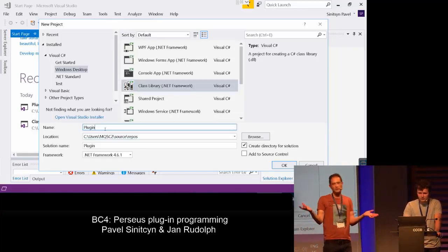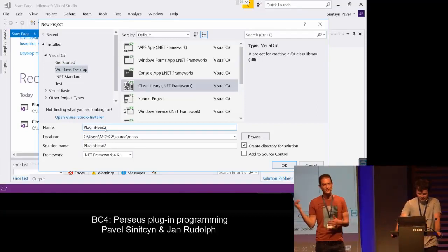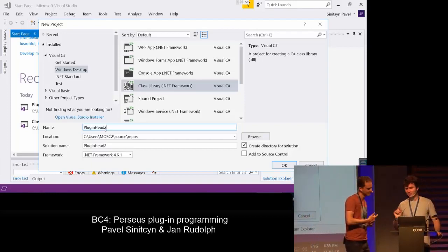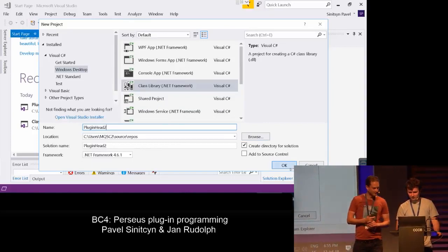There's no point in going into why you need exactly this. For you, I think it's most important to know that that's what you need. But it's really easy to do. Yeah, but let's name it head 2, okay? Okay. Yeah. So okay, cool.